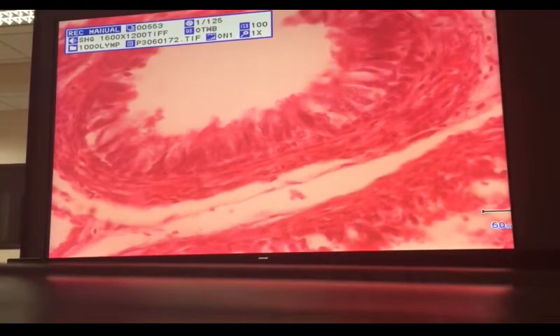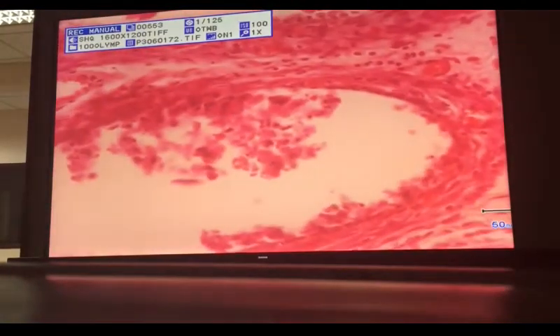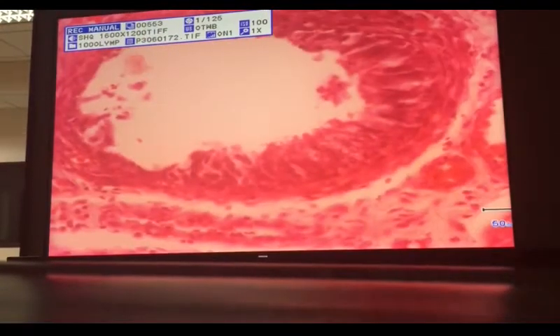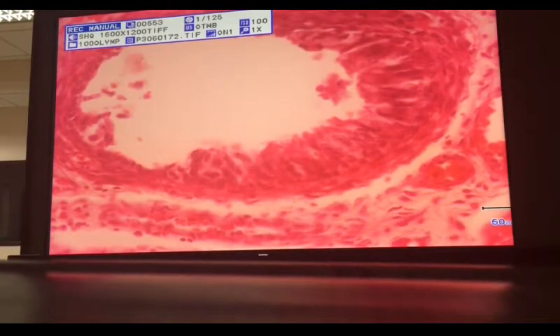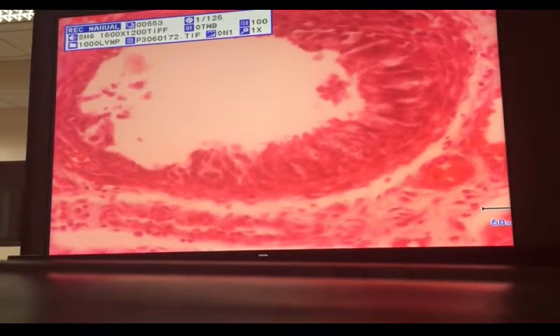Stereocilia are actually elongated microvilli. What is the function of the microvilli? Increase surface area for absorption. What is absorbed? Okay, to make the semen concentrated, those structures are present to absorb water from the semen. And then identify the cells pointed. Spermatozoa.